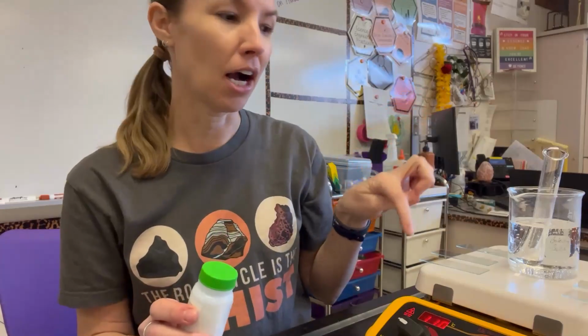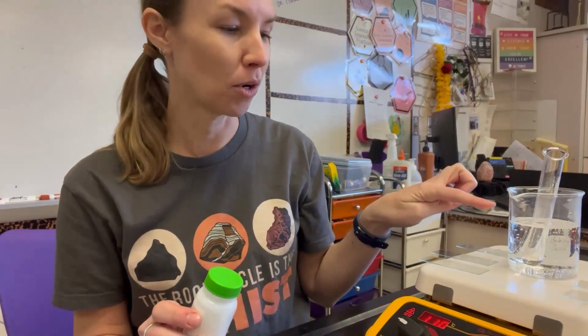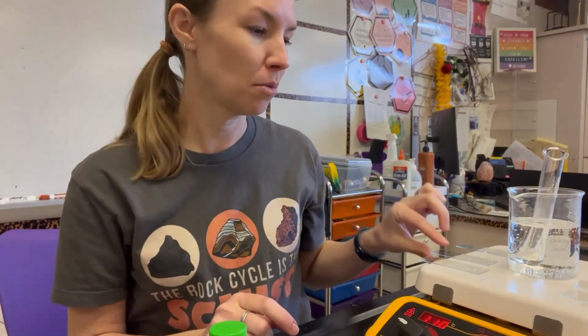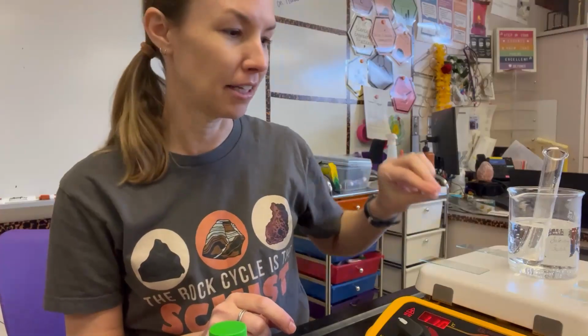You're going to need a hot plate or some type of warm water bath, some microscope slides, and obviously compound microscopes. You're going to want some of the microscope slides to be warm, so I leave them hanging off the edge of the hot plate, and you're going to want other microscope slides to be in the fridge.